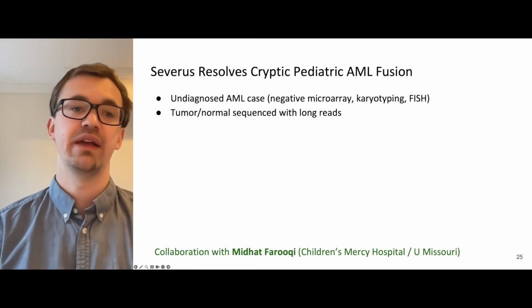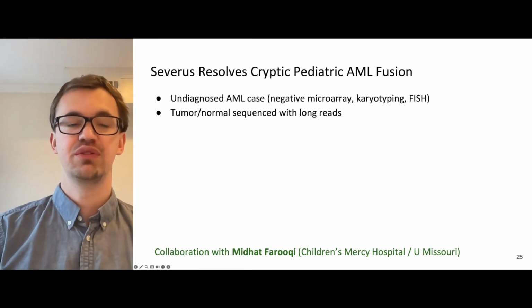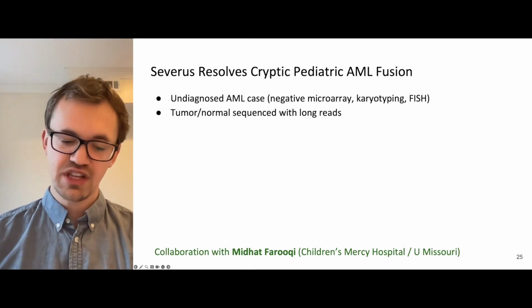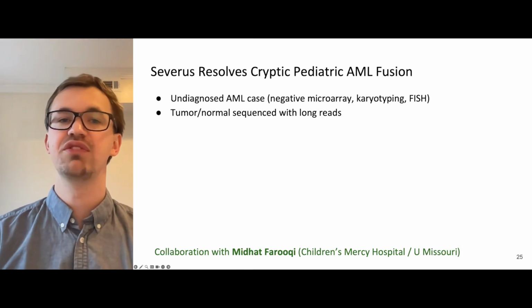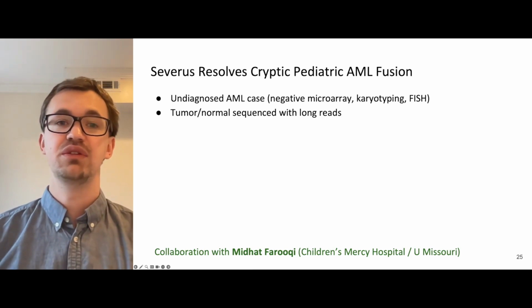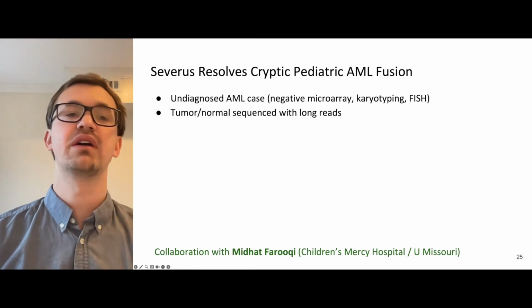And this is an example of an initially undiagnosed acute myeloid leukemia case. And by undiagnosed, I mean it was subject to standard genomic panels, such as microarray, karyotyping, FISH, small variant calls from Illumina whole genome, and this all came back negative. This did not reveal any apparent drivers.